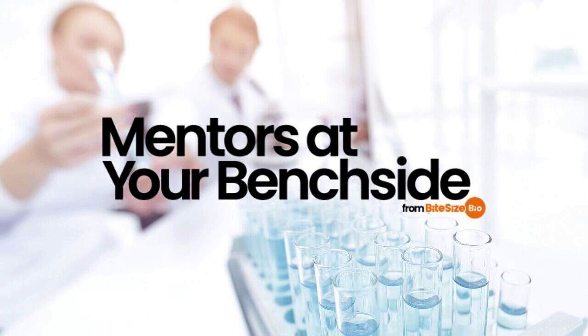Be objective and control as many parameters as possible. Whichever choice for measuring colocalization you opt for, it's very important that the image collection is performed accurately, and make sure your statistical analysis of your protein colocalization data is valid. Try to control as many factors as you can, and prepare a set of control samples that allow you to monitor as many variables as possible.